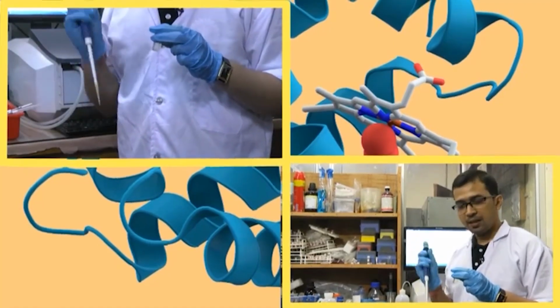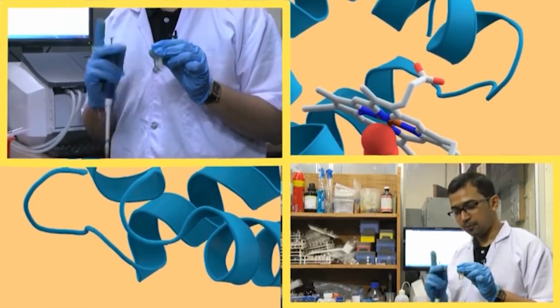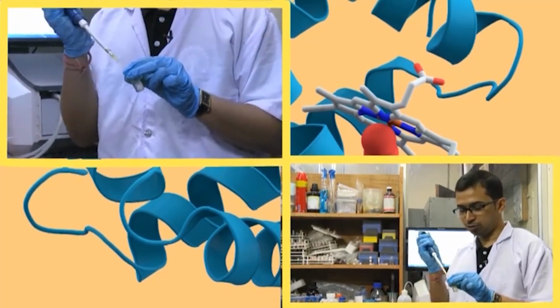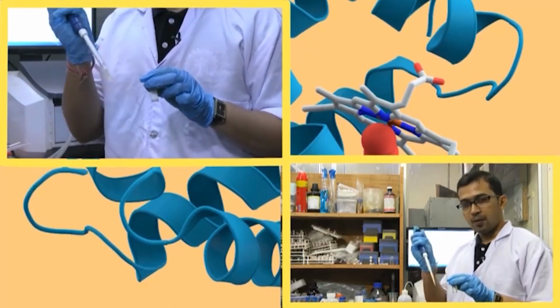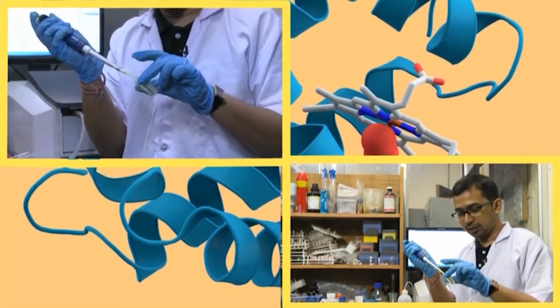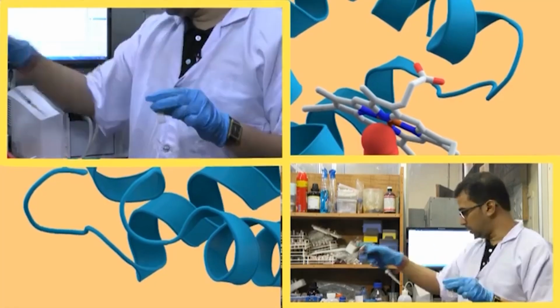Now, in a similar way, we are taking 100 microliter of gallic acid. This is a cuvette. I have washed it properly, the same cuvette, okay, with double distilled water and then ethanol, and then I have taken 3 ml of phosphate buffer in a similar process. Now, I am pipetting out 100 microliter of my phosphate buffer, and again putting in 100 microliter of gallic acid, that is 5 millimolar gallic acid which I have prepared, mixing it thoroughly.